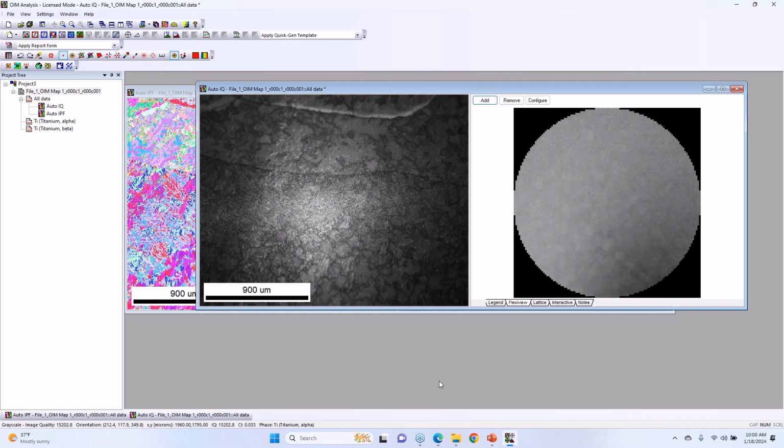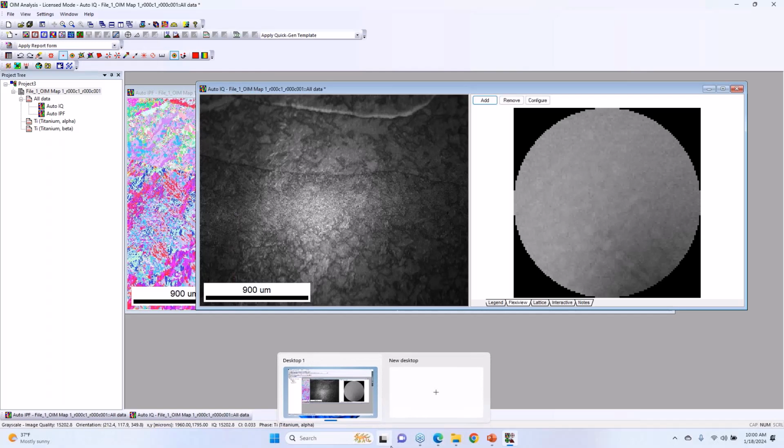Again, for something like this, it all depends on the feature size you're looking for and what you're trying to measure. I think intuitively everyone wants perfect overlap on every field, but that sometimes is harder to get without manually inspecting.